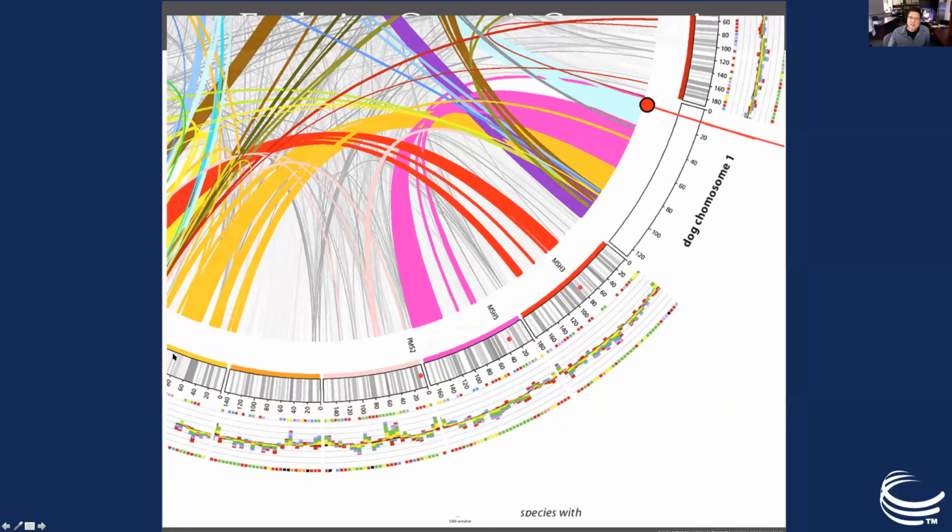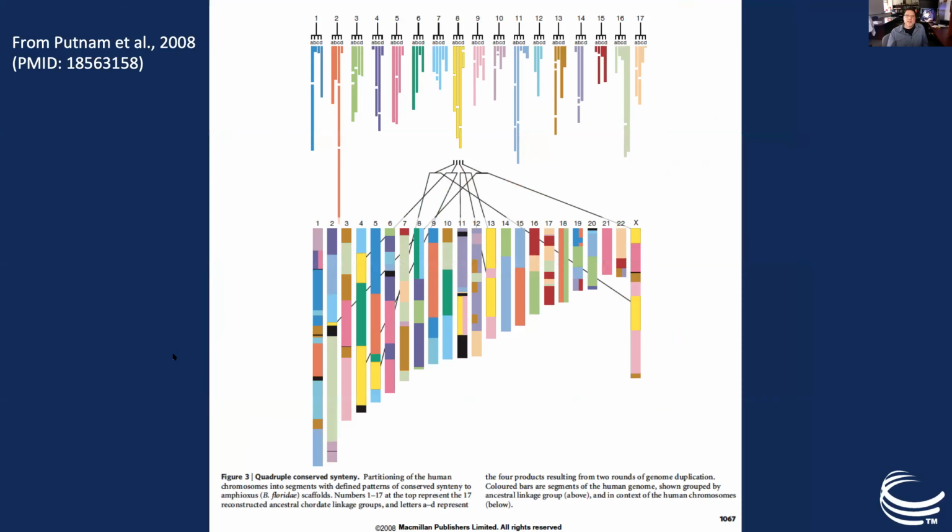So to contrast that, I'm going to show this, which is the typical linear plot. But if we wanted to do the reverse now, if we wanted to look at human chromosome 5 and 9 and see how they relate to this different organism, Amphioxus, you can see it's much more difficult. And I'm not trying to say anything bad about this picture because this really gets the point across of what it needs to get across. But you can see if you were interested in certain neighborhoods of chromosomes, you would want something more like what Circos can make.